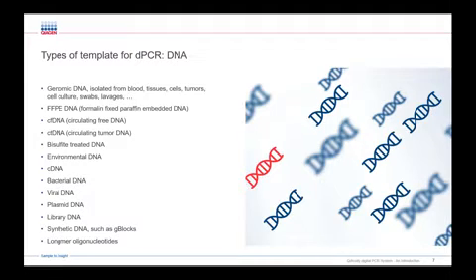Circulating free DNA and circulating tumor DNA frequently have been used as biomarkers and starting material for prenatal diagnosis by dPCR. Methylation analysis requires the use of bisulfite-treated DNA, a starting material for dPCR, which usually is highly fragmented and also, upon treatment, AT-rich.